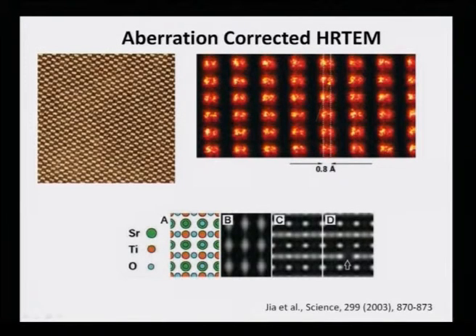High resolution microscopy has evolved quite a lot. As we stand today, we have very high power aberration corrected high resolution microscopes, in which we can even see different atomic arrangements which were not possible even a few years back. The left picture shows silicon crystals. You can even see clearly the silicon dumbbells. We know that silicon dumbbells form inside the crystals, and the silicon atomic dumbbells can be easily deciphered from this picture. The right hand side shows the information limit, or resolution level rather, of 0.8 angstrom, the distance between the centers of the two atoms in the dumbbell structure.